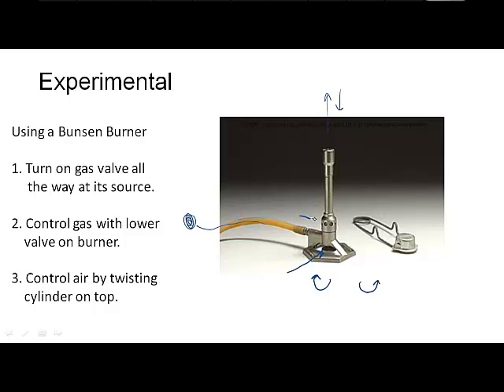You control the air. The air that the gas is reacting with goes in these little holes here. You control how much by letting more or less air in. If you go in that direction, it lets less air in. If you go in that direction, it lets more air in. So you control the air by twisting the top here. The air controls how hot the flame is. Let's look at a little video of this.